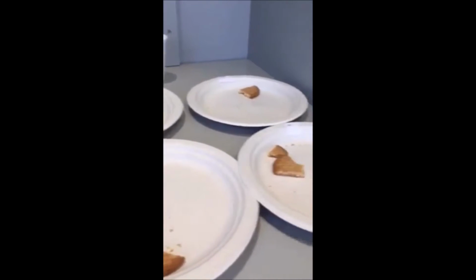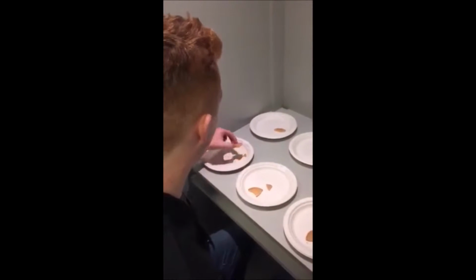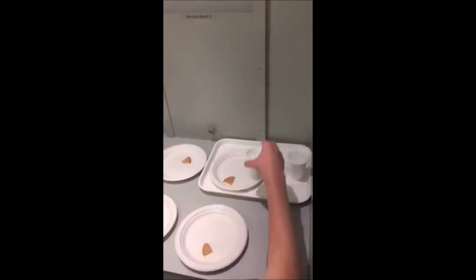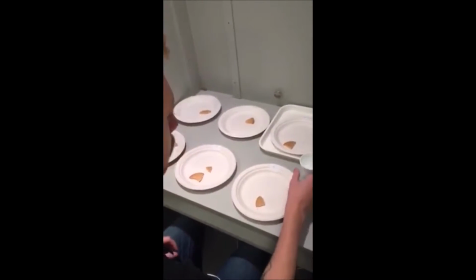The panelist is verbally instructed to taste the first set from left to right. After each sample is tasted, the panelist is told to expectorate the sample into the spittoon provided and rinse the palate with the water provided. The panelist is then to make a decision on which sample is different from the other two. These steps are repeated for the second set.